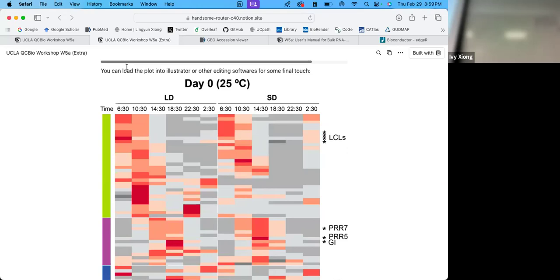Sorry, you've got a second. One second, sorry. I'm just trying to reload this part. I want to change some lines, like changing the entry part to 15 or 16. Once I find it here, it's a copy paste and then I know how to go back to changes. I'll try to run this. You can press Control C to cancel. Control C. Yeah, so you cancel that.